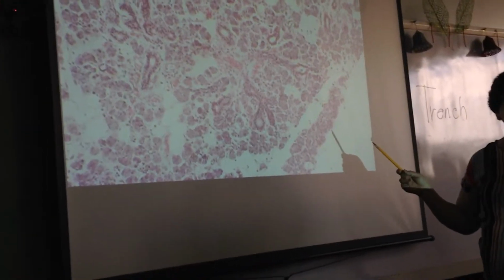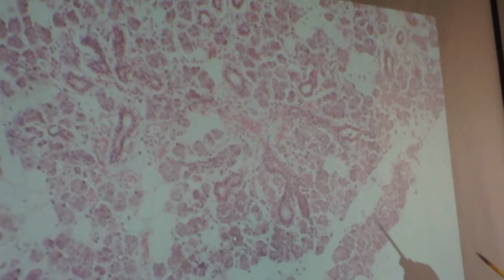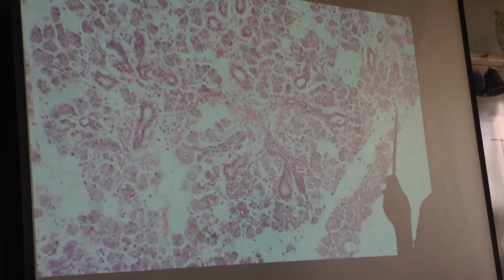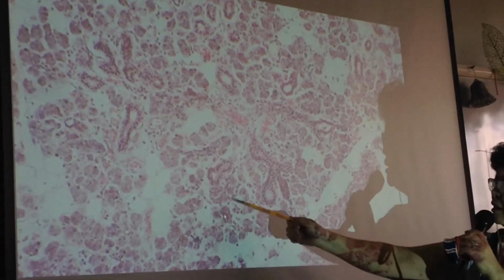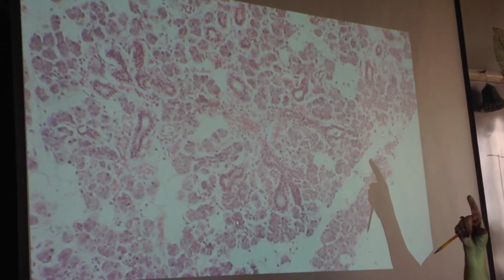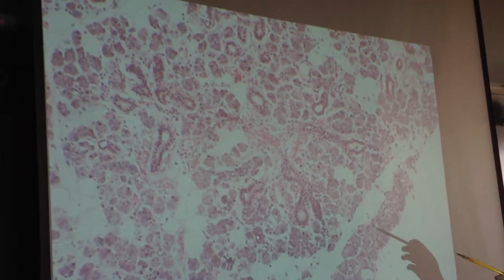This is the submaxillary gland. The submaxillary gland, otherwise known as your submandibular gland, is a mixed gland again, but this time it is abundantly serous, with very few mucous. So you will see a lot of serous acini. In one slide, 21B, you have the two glands, the sublingual and the submandibular.